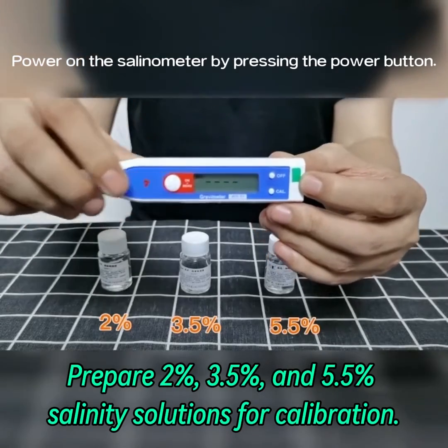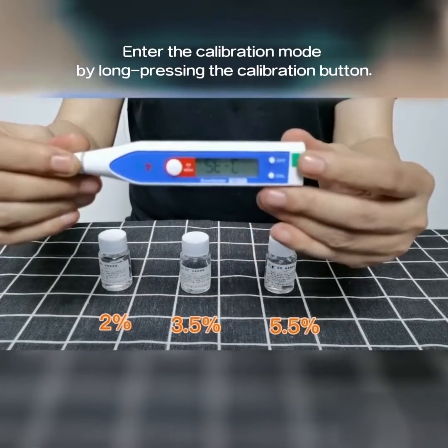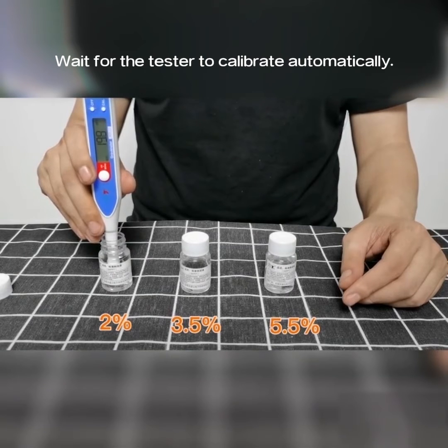Power on the salinometer by pressing the power button. Enter the calibration mode by pressing the calibration button. Insert the probe into the 2% calibration solution. Wait for the tester to calibrate automatically.